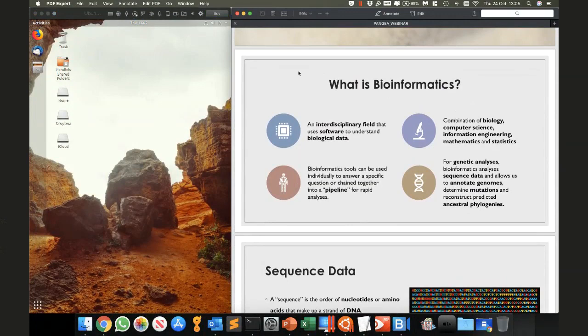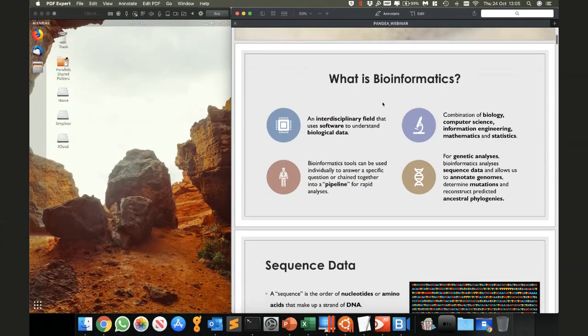Say, for instance, you might have an automatic pipeline which takes your reads, builds them into an alignment, looks at drug resistance, and then outputs something nicely at the end. But unfortunately, it's quite difficult to string all those things together. So we'll go through some of these tools individually and then hopefully learn what's going on.